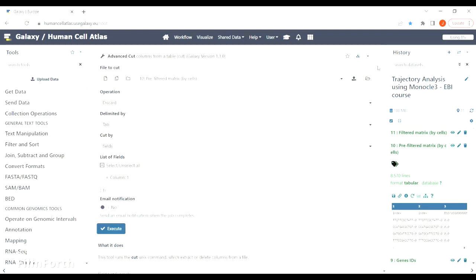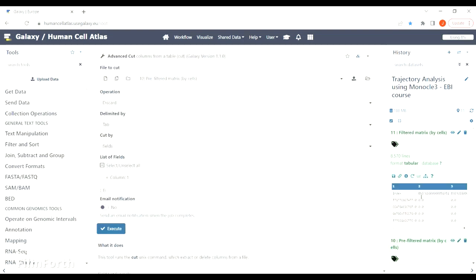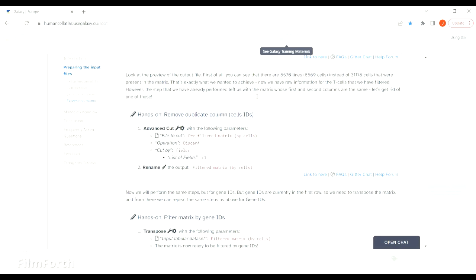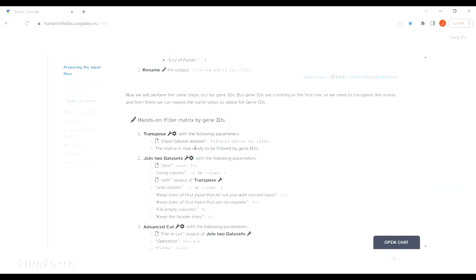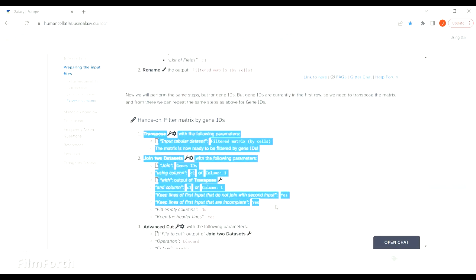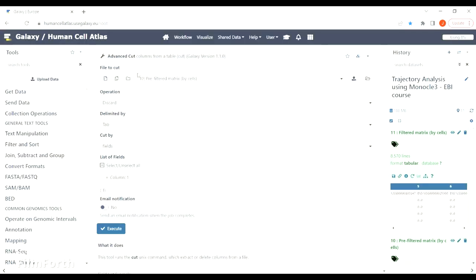The genes IDs are currently in the first row, so we need to transpose the matrix and only then we can perform the same operations as before.